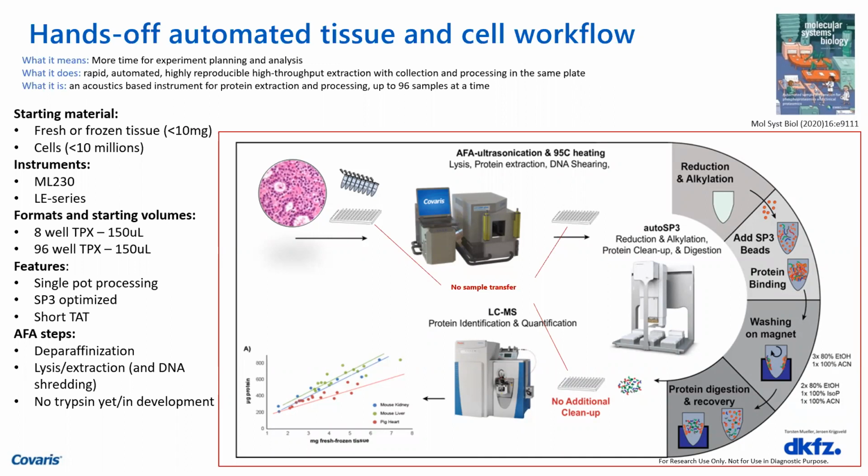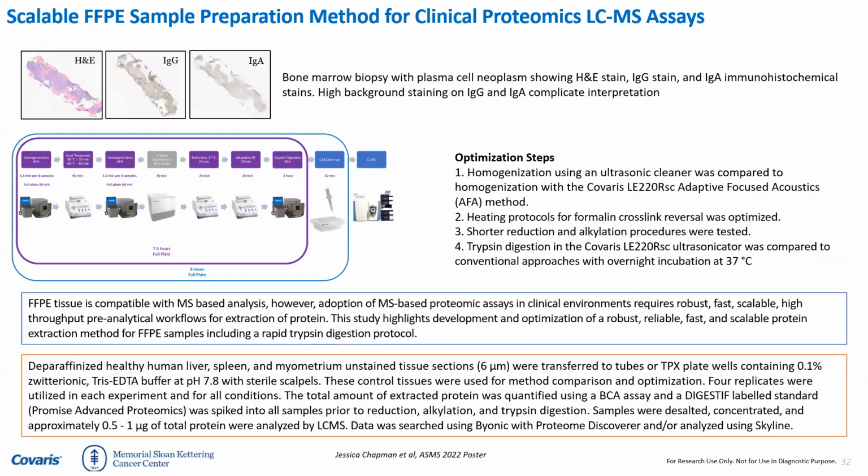And he then puts it in the mass spec and he gets his data. He does it in an automated fashion. And what he's using over here is the AFA, which is happening in the background. So it's very complex, but once you get into a rhythm, it's actually not that bad because you let the system run the course for most part of the time.